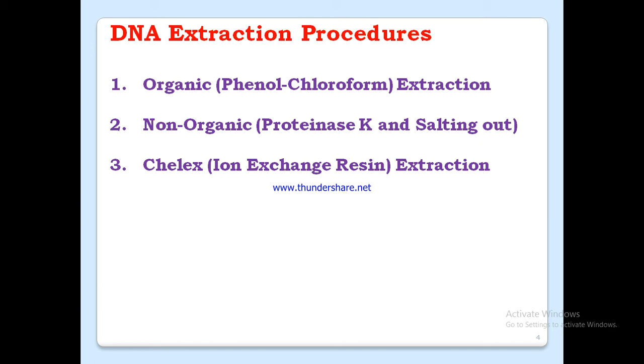DNA extraction procedures: organic phenol-chloroform extraction, non-organic proteinase K and salting out, Chelex ion exchange resin extraction.